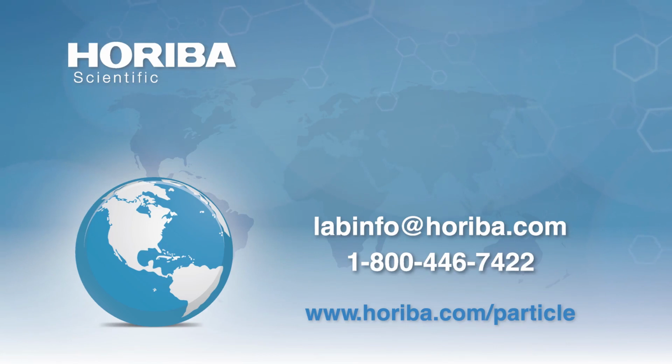But we have certainly seen applications where we've struggled there, and applications where the change in reflectiveness of the particle has been too significant to keep track of it throughout the process with the icon. So really better used on these white, cream, or light colored materials.